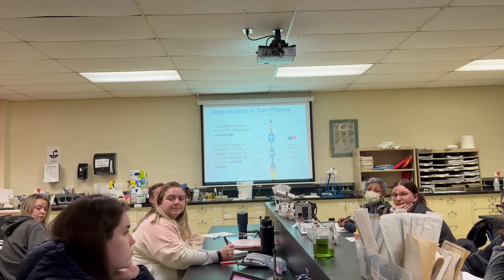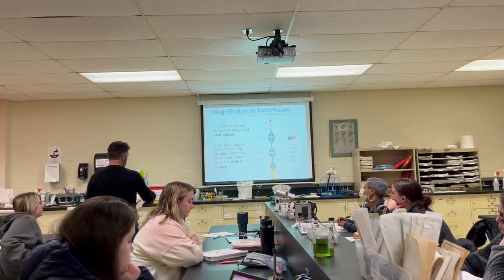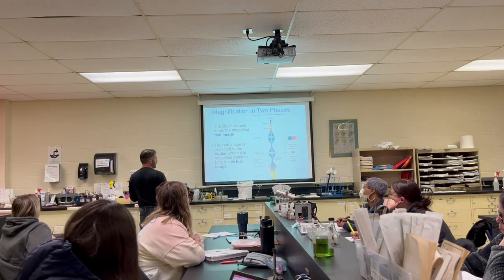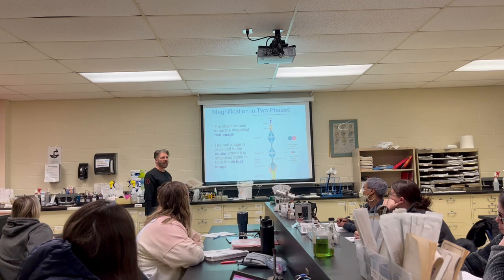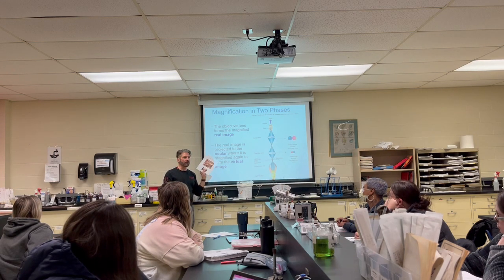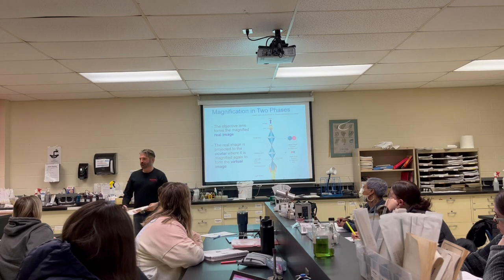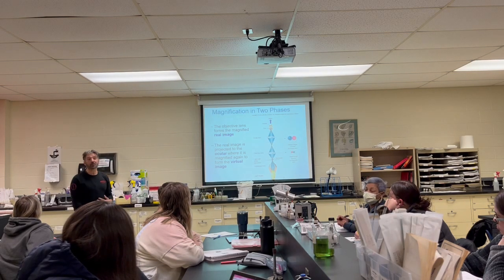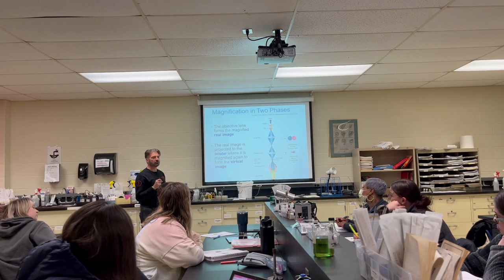I say that because 2 years ago, I went in for my eye exam, and the doctor said, Phil, you have demodex in your eyelashes. I go, what the hell are you talking about? And he showed me a picture. He goes, yeah, those are living in your eyelashes. They itch like crazy. It was shocking, especially because I'm an optician and I've never heard of it before. I'm like, what? So please wipe the oculars off in case there's any critters living in there.